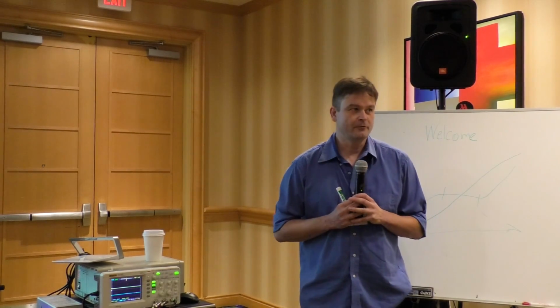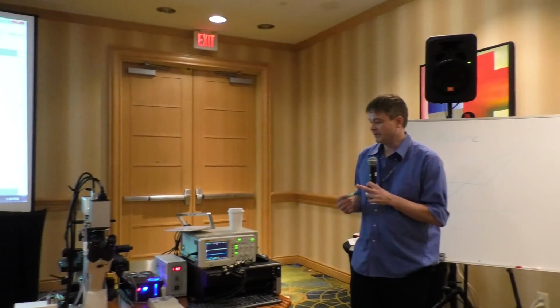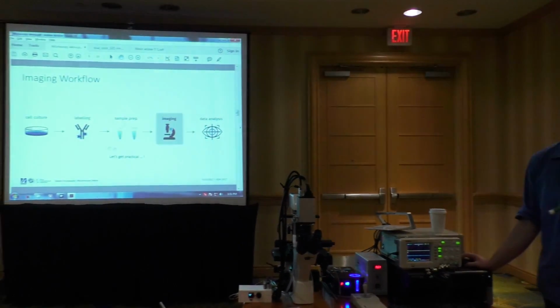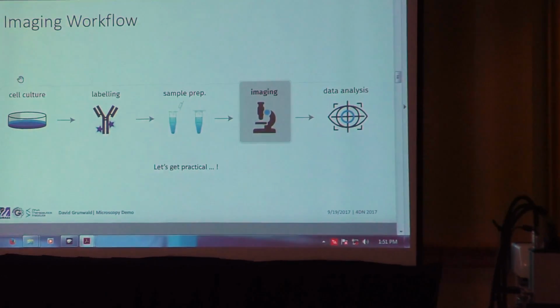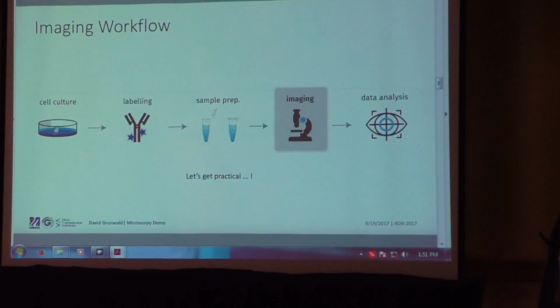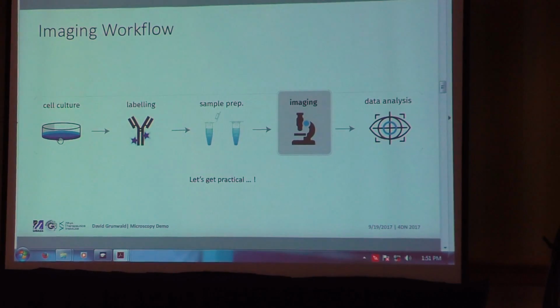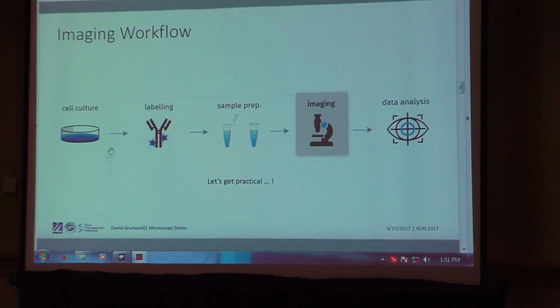And that is we can look at the workflow of what it is we do. Well, what we do is we basically have a lot of different components in our experiment until we get to having some data to analyze, right? Dave Gilbert and the Cell Standards group have been doing a hell of a job creating SOPs that try to address this part.